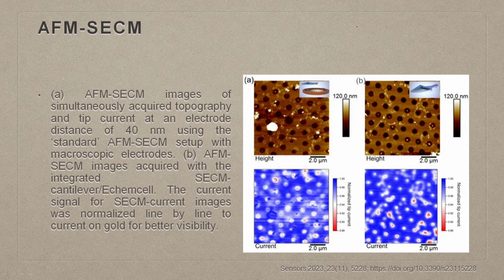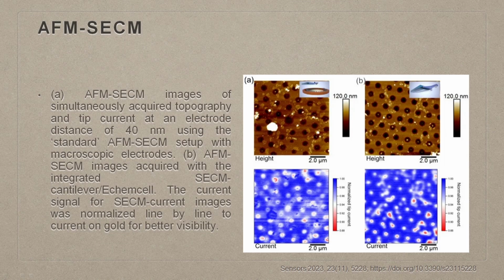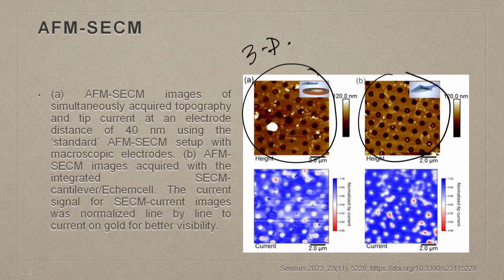Now, if you take the parallel image of it, so far what we did, we tried to image the whole substrate, right? Here, what you are seeing is imaging the whole surface. Now, if you look at this image, this is how it looks. So, you see the three-dimensional features are coming back, and these are the zones where you see certain features which otherwise were not present.